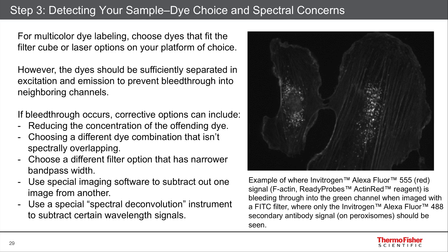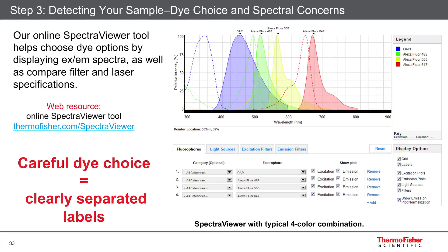You can also choose a different filter set that has a narrower bandwidth, though most people don't have a lot of filter sets to choose from, so that's not always a reasonable option. Or you can use specialized imaging software to subtract one image from another. Usually those first two recommendations are the best: reducing dye concentration or choosing dyes that are farther apart. We have a tool online called the Spectra Viewer at thermofisher.com/SpectraViewer.